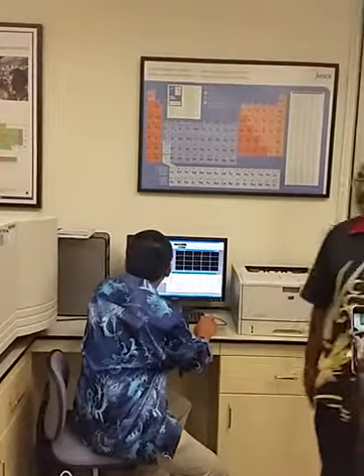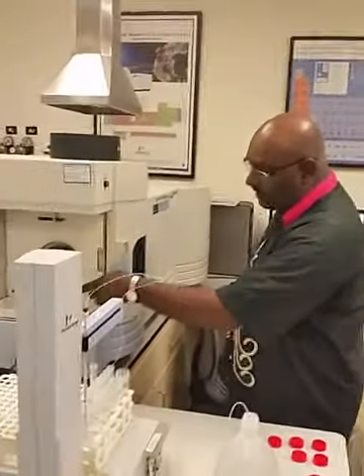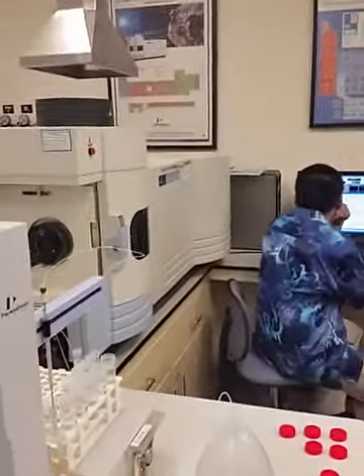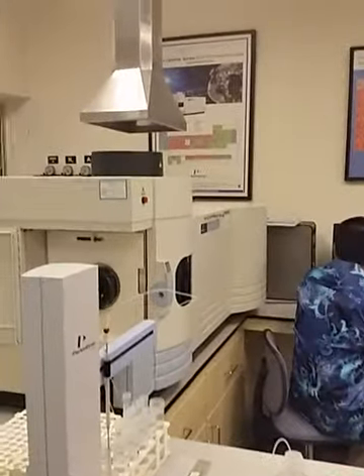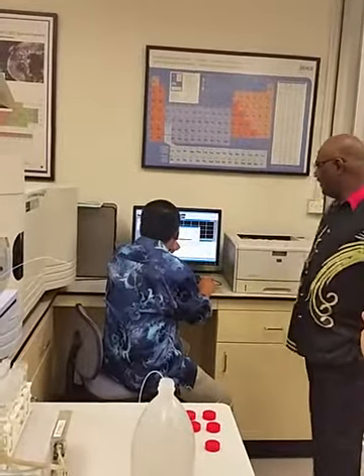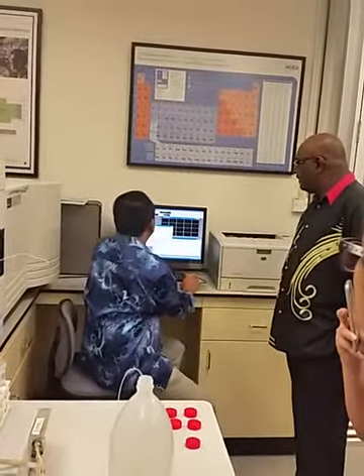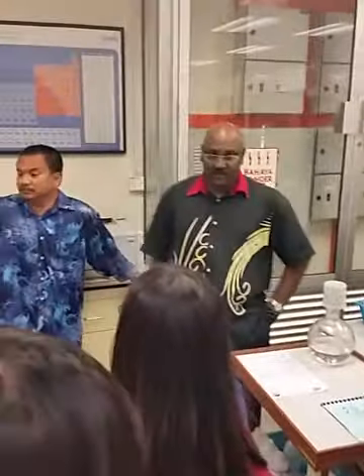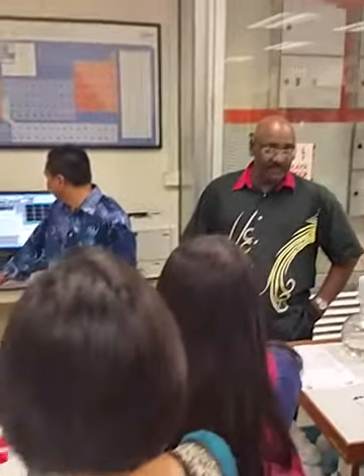The concept here is that the sample will be injected into a nebulizer inside, to form a plasma. He will show you how the plasma is turned on. The plasma is how many degrees? Plasma is 10,000 degrees Kelvin. Very hot. You know what plasma is, isn't it? What is plasma? Gas, electrons. Another state of matter, like solid, liquid, gas, and plasma.